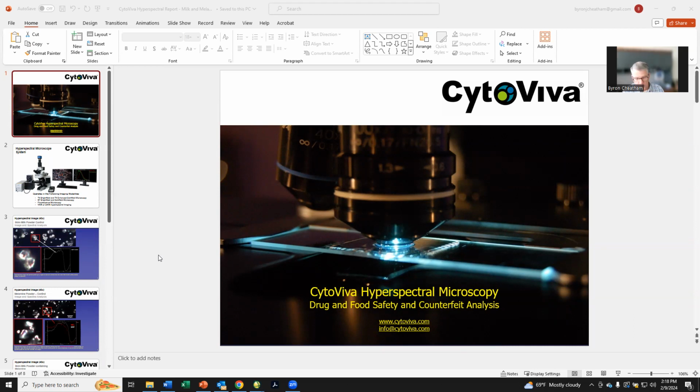Our friend Neil Bogart had asked us to create a brief video talking about how hyperspectral microscopy is utilized in the food safety counterfeit analysis process, as well as for drugs. And so we created this very brief video just to illustrate how hyperspectral microscopy is used in these applications.